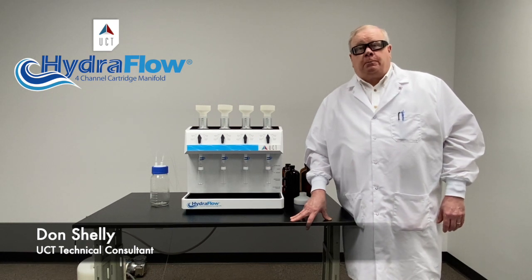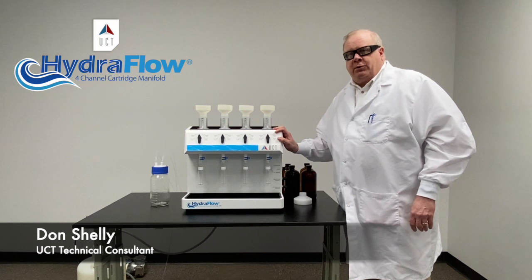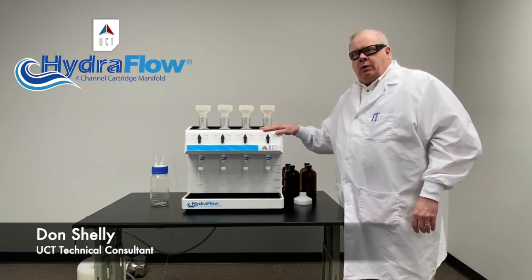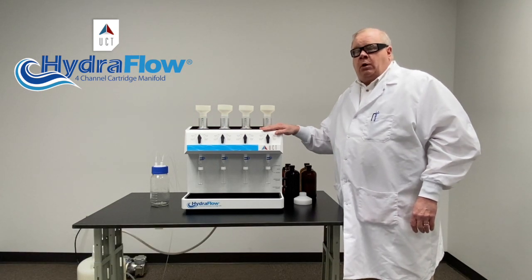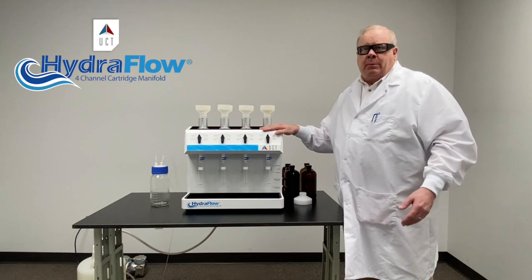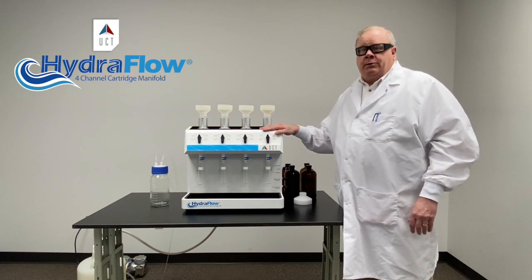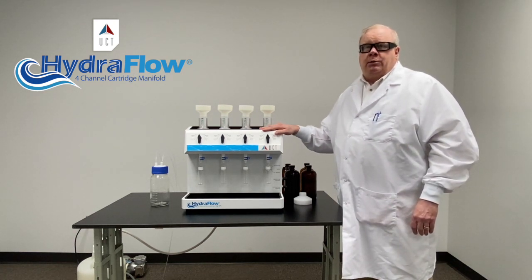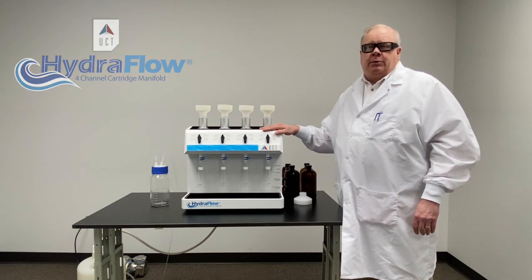Hello, and welcome to the HydraFlow. This manifold is a huge improvement over what you've been used to. The main benefits are they give you more precise flow control, so you will have more lot-to-lot or batch-to-batch reproducibility, and hopefully fewer re-extracts because you have more control over your flow rate. Also, it's a much shorter learning curve for your technicians — with just a small amount of instruction, they can be up and running on this in no time.